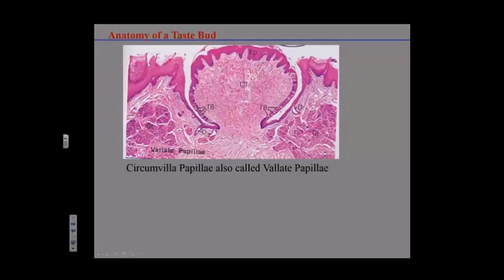Okay, so this is non-keratinized stratified squamous epithelia on the surface of your tongue, and you have some glands in here. Okay, von Ebner glands, that secrete. Here's a duct secreting into the crypt. Here's another duct secreting into the crypt, and these are glands within your tongue. Okay, so this is serous, and there's some mucus glands in here too.